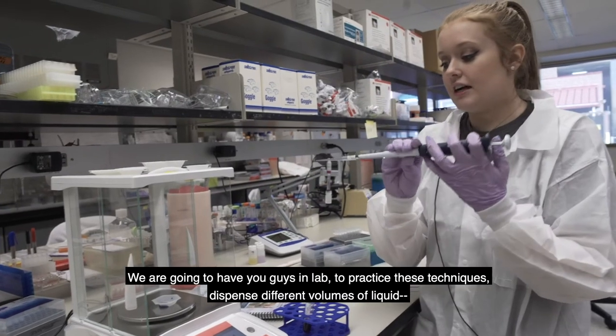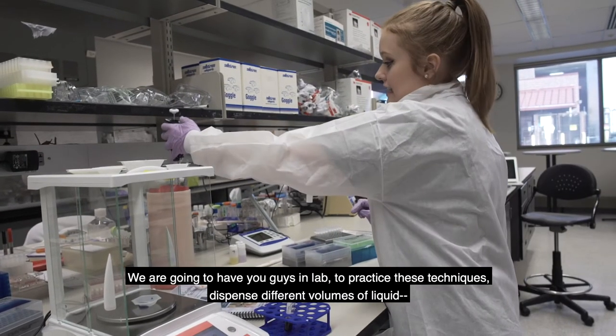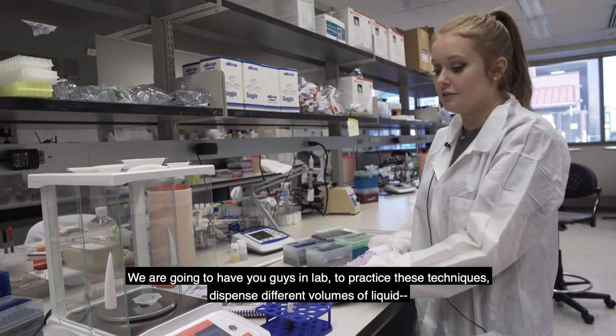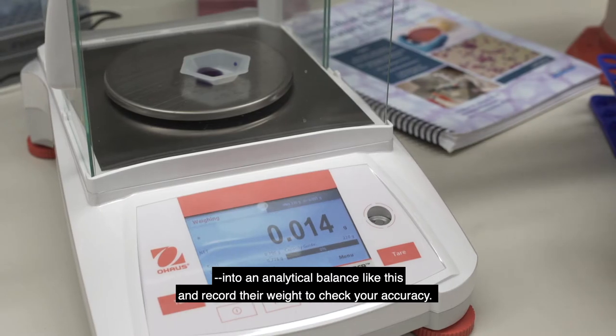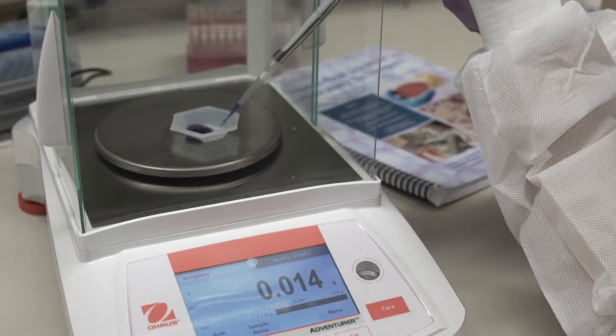So we're going to have you guys in lab to practice these techniques, dispense different volumes of liquid into an analytical balance like this, and record their weight to check your accuracy.